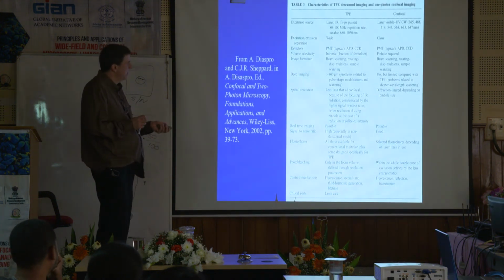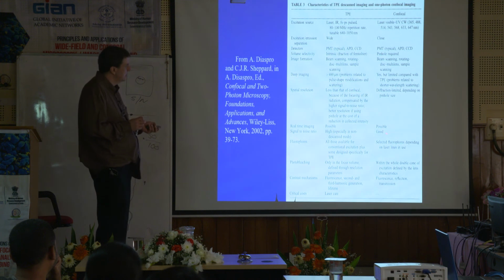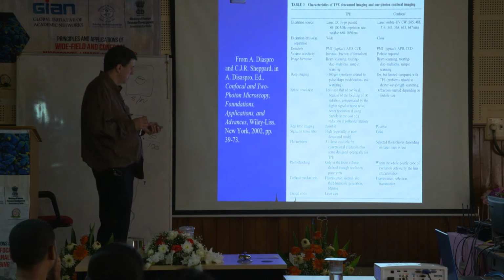This is just a comparison of some of the stuff between 2-photon and regular confocal. Some of the things we talked about, just showing you what the pros and cons are of each. And like it says here, critical cost, laser care for the 2-photon.